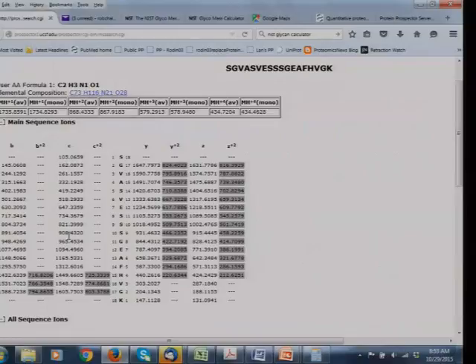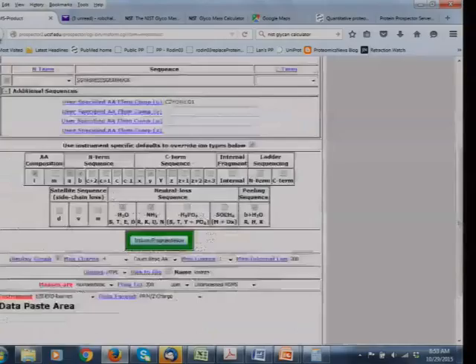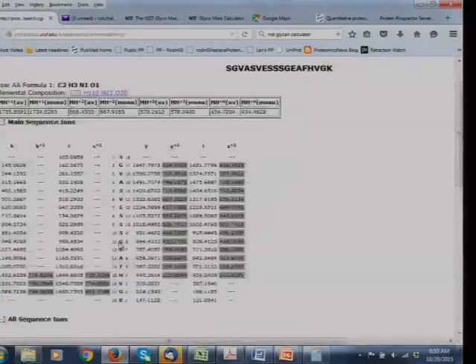What if we put the HexNAc on that 908? What mass would we expect then? Which serine was that? So that's the third of the 3 serines.